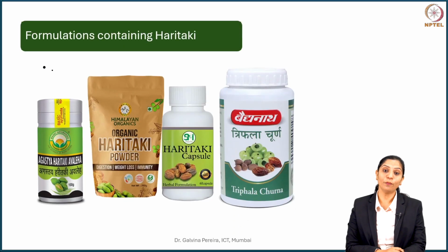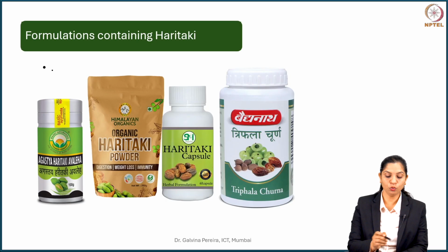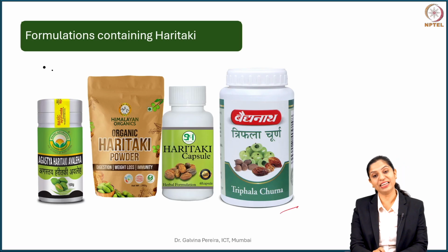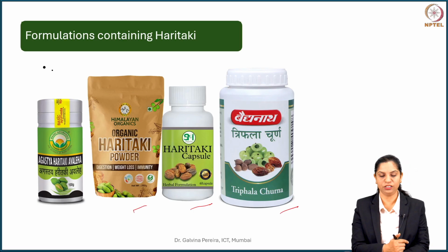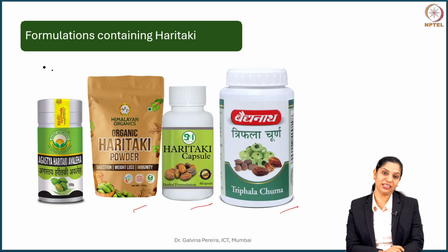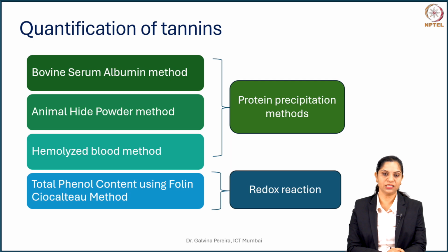So here are a few formulations which you can use as a sample. Say for example, I have to do analysis of tannins in Triphala churna, or specifically a Haritaki sample or Haritaki powder, or an avleha, which is more like your Chyawanprash. So all these are different matrices. Now if I have to do a quantitative analysis, there are 2 ways in which I can do this.